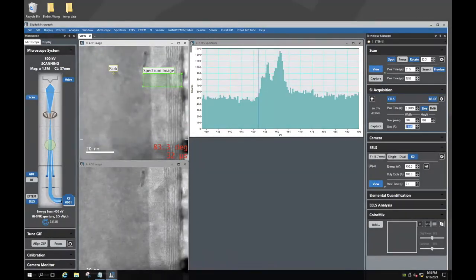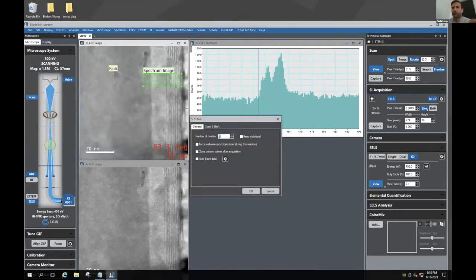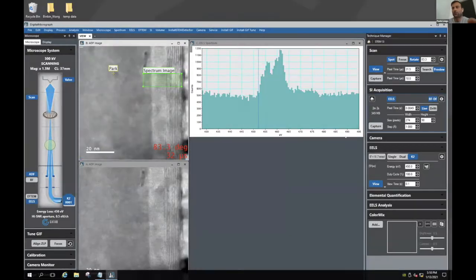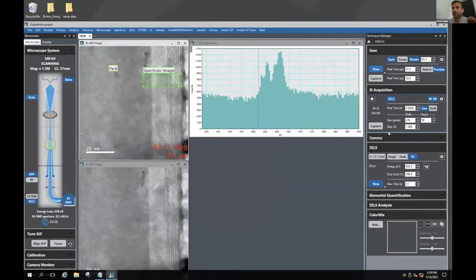You want me to increase the magnification? I know, it's fine, it's just a quick run. Let's check here, I'm not gonna do this correction, but potentially you can tell the software to close the valves after the acquisition. You can do sub-pixel scanning, but that's not the case because the step size is pretty small.